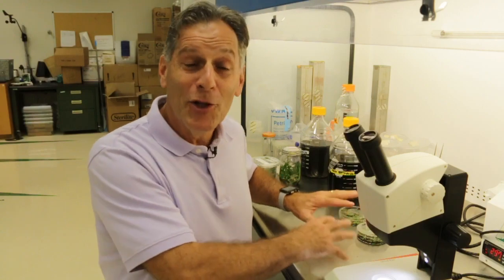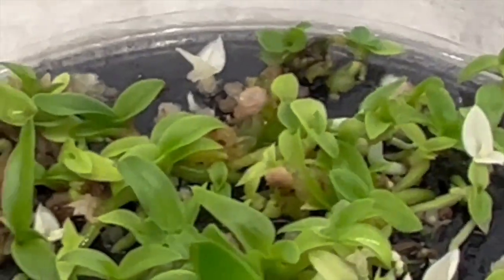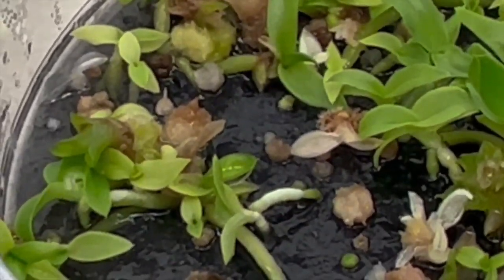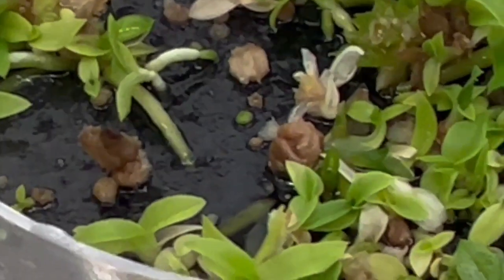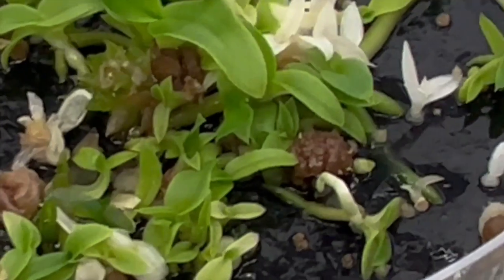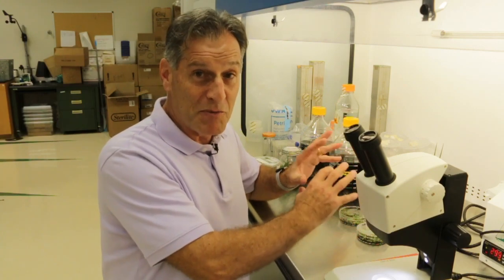But, all right, let me get to the other point here. So the point is, in looking at these plates, you can see clearly green seedlings in here. You can see clearly albino seedlings. And then you can see stuff that's interesting, which is maybe some yellowish seedlings that are in there. And those are interesting, number one, if they continue. These are old plates, so it might just be yellowing of some older seedlings in there, but it also could be a variation of this mutation that we're seeing that's giving the albino plant. So there could be yellow orchids in here.